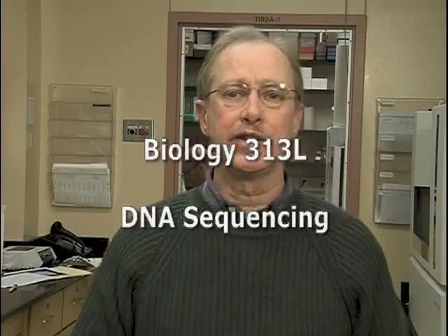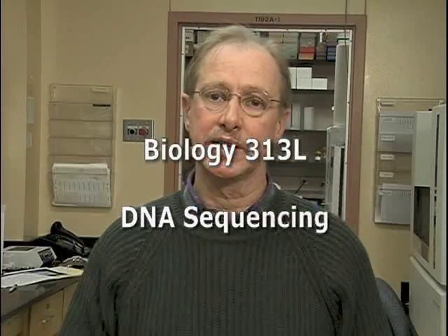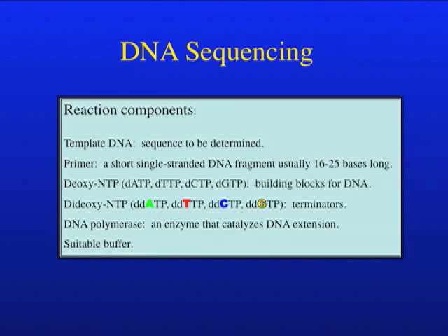Thanks Claudia. I'd like to welcome all the biology students to the DNA facility. Recently you've been studying the Sanger chain termination method of DNA sequencing in class. As you know, we can divide the process up into two major components: setting up the sequencing reaction in a manner similar to setting up a PCR reaction, and then making sense of the products of the reaction through the use of electrophoresis. Let's quickly review the components of a sequencing reaction.